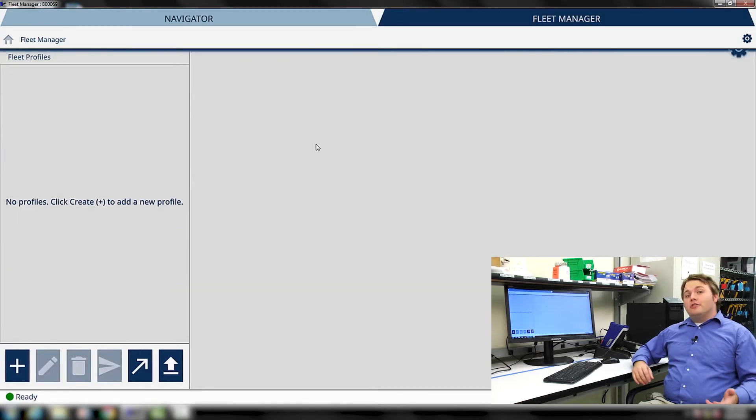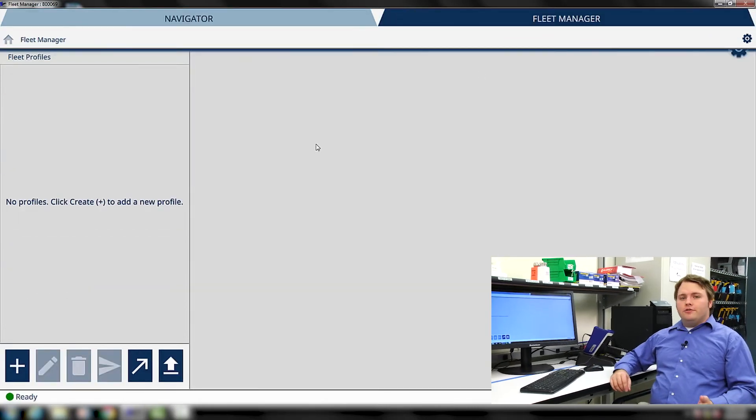Fleet Manager lets you customize user settings, libraries, and templates in a way that they can be deployed to multiple instruments in your fleet. This way, administrators can control which features their operators have access to, and this is all controlled through Fleet Profiles.